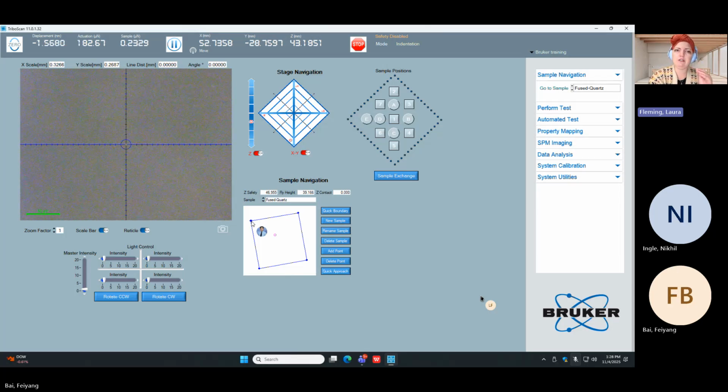I thought the Z focal height saved with that sample zone was incorrect, but I had forgotten how tilted the aluminum sample was. So it was in a focal height, just not the focal height for that point we were looking at. The sample zone saves the X and Y coordinates of the sample, but also saves the Z focal height. Now that you've right-clicked, we are nominally in focus.